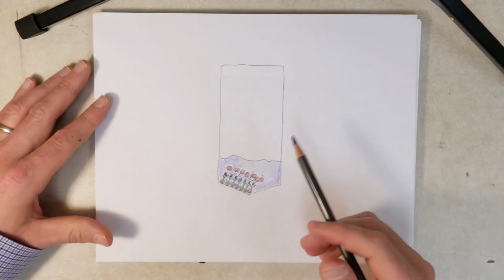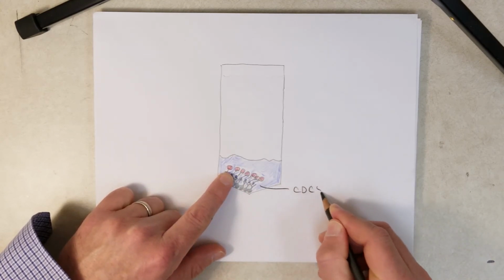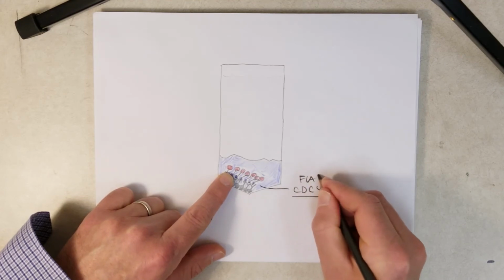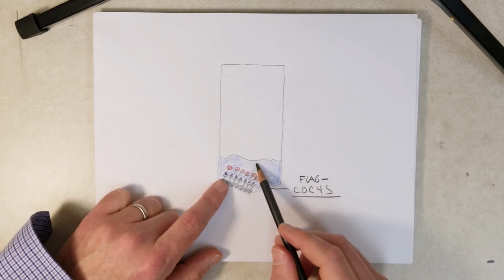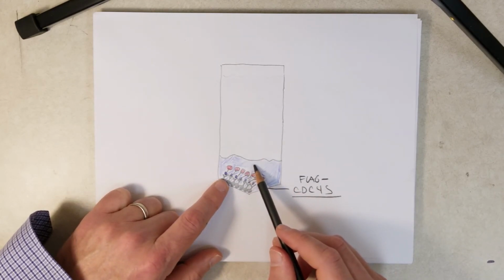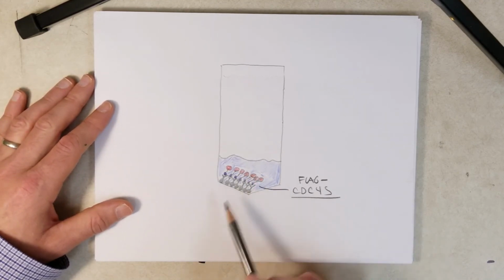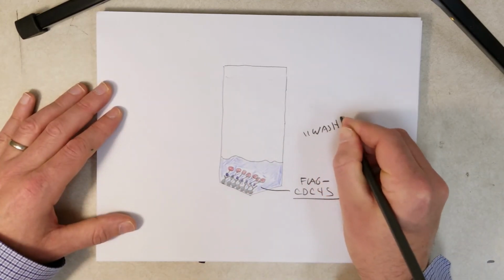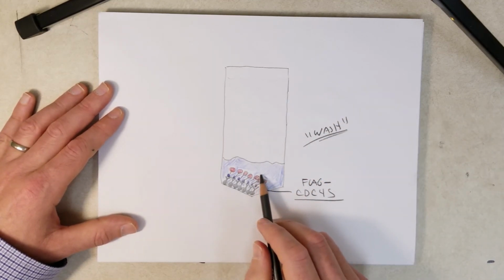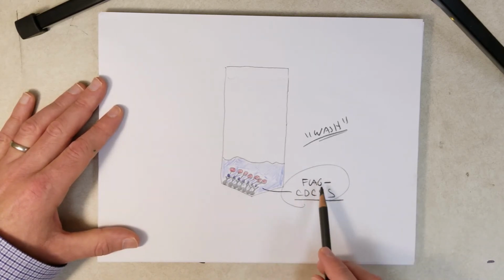And we'll get something like this. Whoa, where's my other? Okay, here it is. So a solution with just CDC45, the flag tagged version of CDC45, and the magnetic beads. Now we might have to change the solution a few times here to get rid of any residual other proteins that were here, but we can wash this a couple times. Wash means change the solution a couple times, so we really reduce the number of contaminants in here, so we can get our purified flag CDC45.